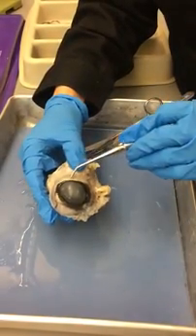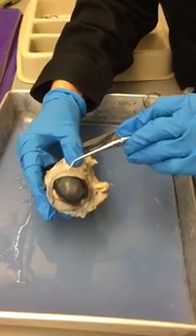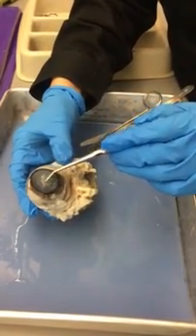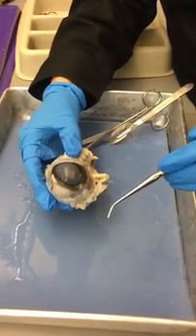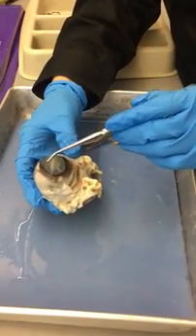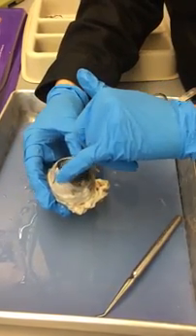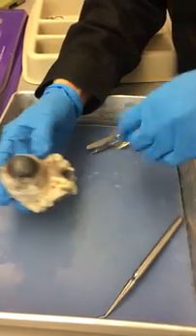So this is going to be the sclera, the white part of the eye, and this is the cornea. Cornea is a clear layer, but because this has been sitting in preservative for so long, it's not so clear anymore. It's opaque. So what I'm going to do is just cut around the cornea.